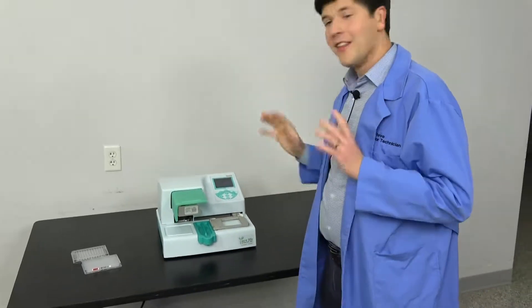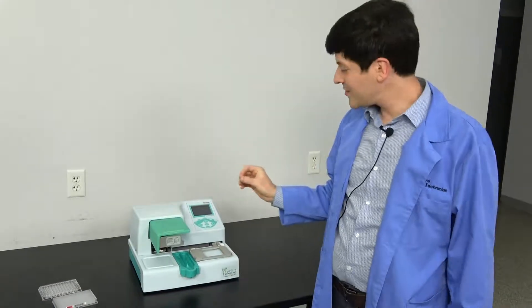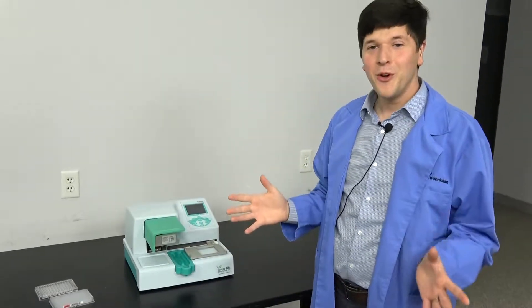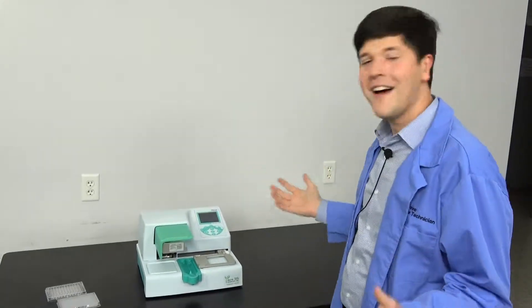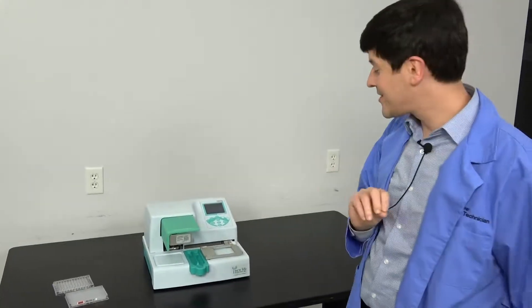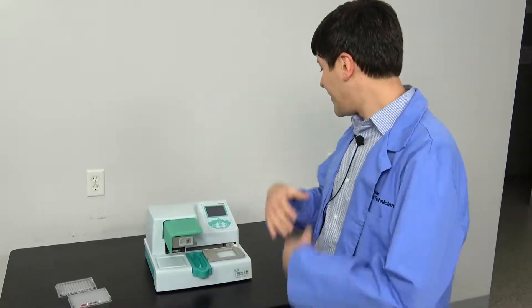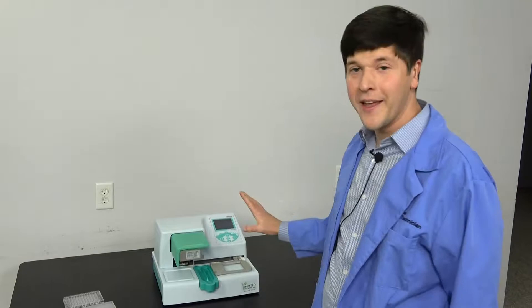A lot of you are probably familiar with this instrument. This is a dispensing powerhouse. I'm sure all of you have Bobby the undergrad in your lab who can do some multi-channel pipetting for you, but maybe he's not quite as chipper or quite as speedy as this sucker. So if you need a plate in a hurry dispensed in 384, 96, or even 1500-plus format, this is the machine for you. It can fill a plate lickety-split.